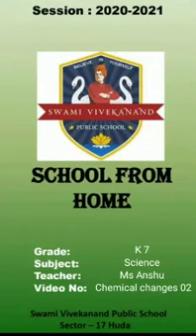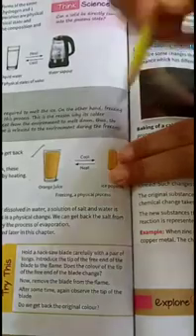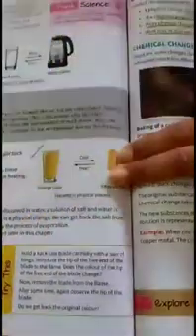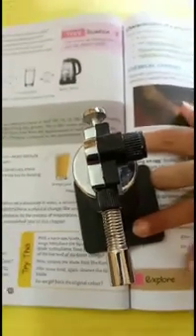Hello students, let's continue with our chapter Chemical Changes and Reactions. We will be starting with this activity today. For this I am using a blowtorch and a knife in place of a hacksaw blade. Now see what happens.